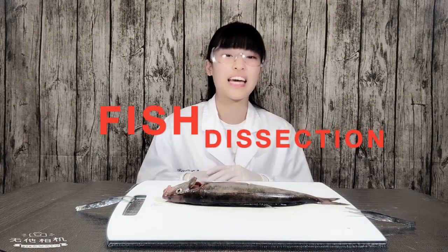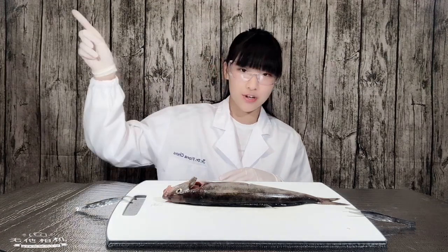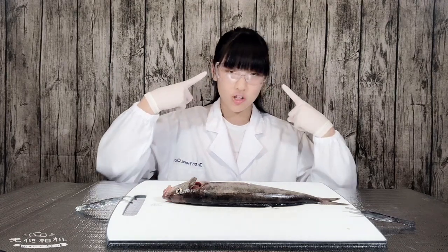In today's video, we are going to dissect a fish. Before watching this video, if you're sensitive, please shut this video down immediately. And second, before watching this video, remember to go and look at my dissection precautions, including cautions about lab coats, gloves, and goggles. Okay, now we can start.